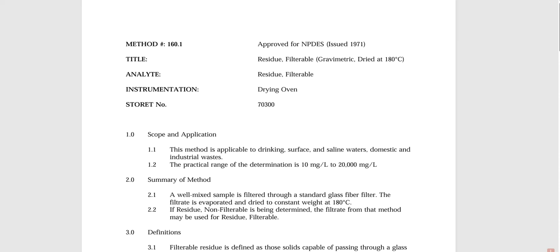Alright, guys, in the last lab, you probably experienced an EPA method. It was a very basic EPA method, and it was just like, hey, let's use a pH meter and measure some pH values of some soil samples that we brought into the house. The reason we did that, of course, is because soil is a solid, and you might have seen a pH meter and pH theory back in 114, which is our wet laboratory technique course, but we never brought in solids. It was always like, here's a liquid, let's measure a pH. Here's another liquid, let's measure another pH.